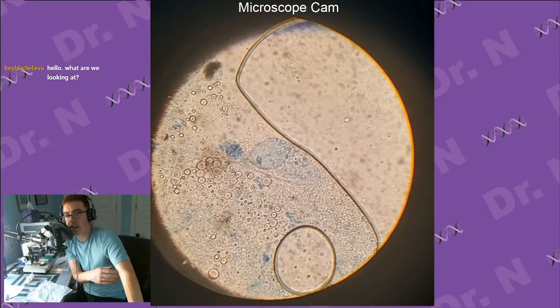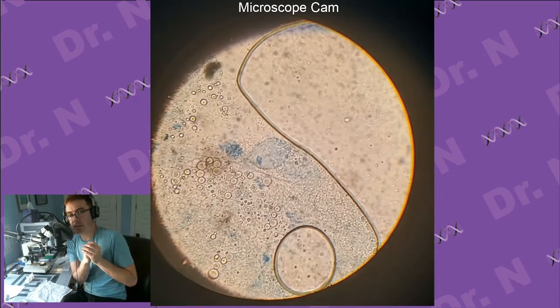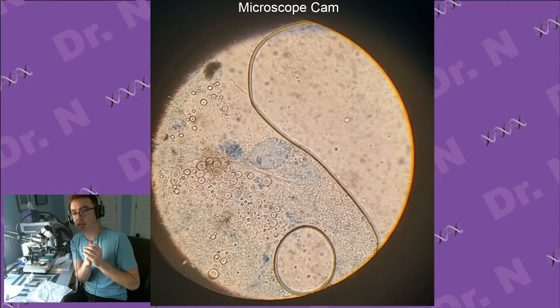We are looking at a fruit fly larva, specific organs, the salivary glands, which I've taken out and squished down really, really hard. And now I'm trying to stain them or dye them for DNA. So really hoping we'd see some chromosomes with this, but I think my setup, well, no, I know my setup isn't quite good enough for that, but we're trying regardless.